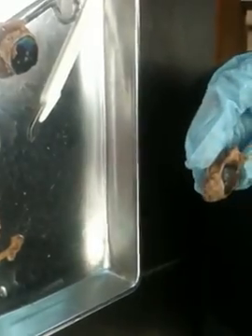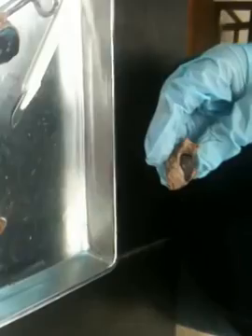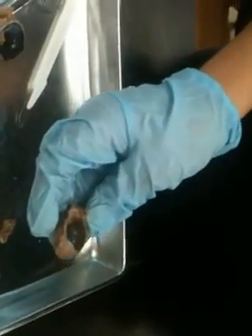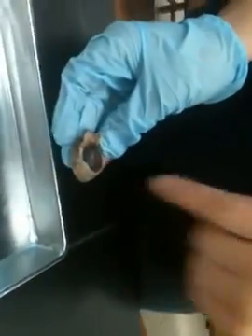So is the iris the one on there? Yeah. That's the iris? You can't see the striations around the iris? Oh, you can't actually see the iris from this part. The iris is the colored part of the eye. Okay. So when you look in here, you can see that, and it's underneath this clear part, which is the cornea.